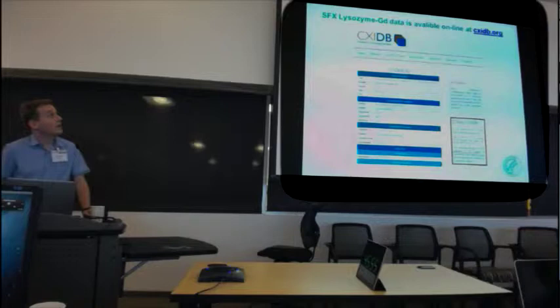So we are going to log into PS login. We can try to increase the font so that everybody sees me. Okay, now we have logged into PS login.